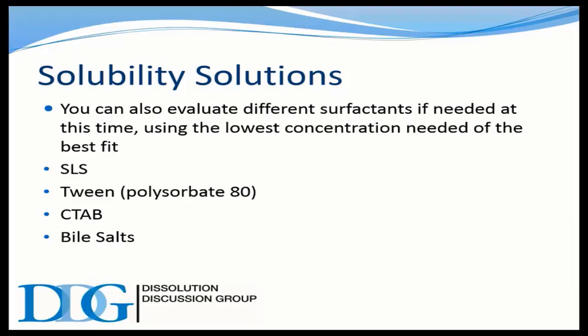For a generic, it's much easier, but it's really dictated by the fact that you are trying to put a certain amount of drug in solution and you do need an excess. So volume is really not mentioned in this. I don't remember in chapter 1236. Do you, Vivian? I don't think it comes up and says you have to use a 250 ml flask or 500 or something. Yeah, I think it more comes with the BCS classification. They give you 250 mils of your highest dose. Okay. That's all I know.